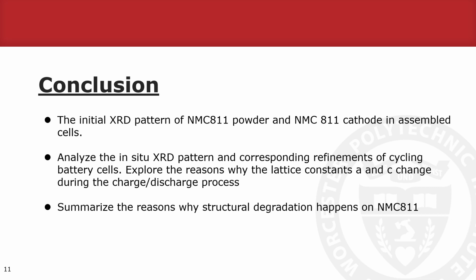It is considered that the mechanical tension at high voltages is the main reason for structural degradation. However, it's really a complex process that needs more discussion. But this does demonstrate that in-situ XRD is a useful tool in lithium-ion battery research.